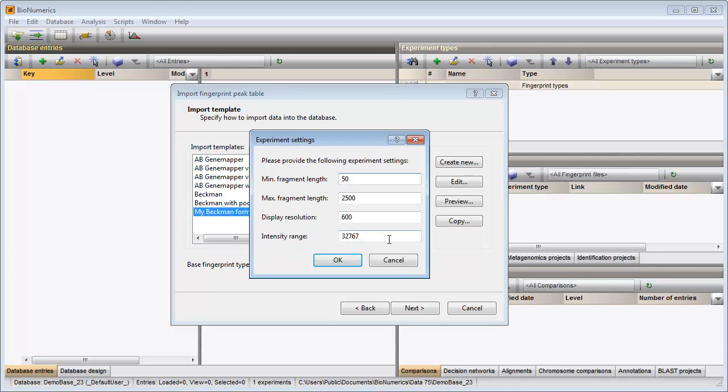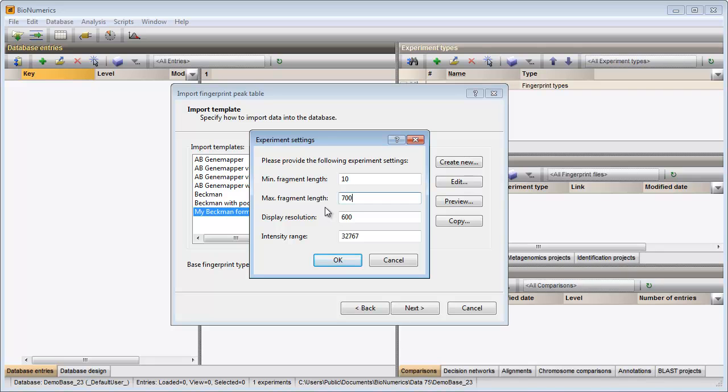In the next dialog, a few experiment settings for my new fingerprint type experiment need to be defined. The minimum and maximum fragment lengths, the resolution and the dynamic range, which is 16-bit in my dataset.